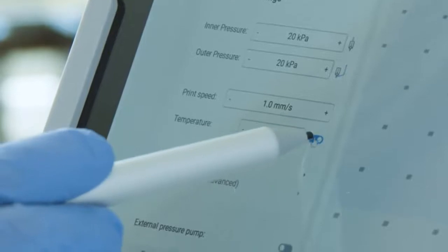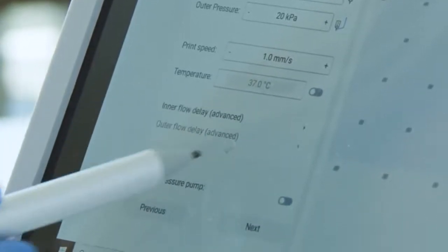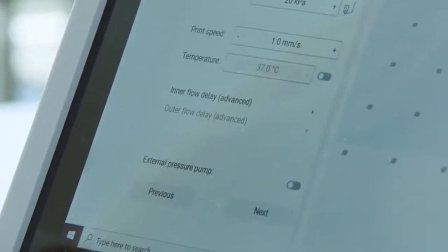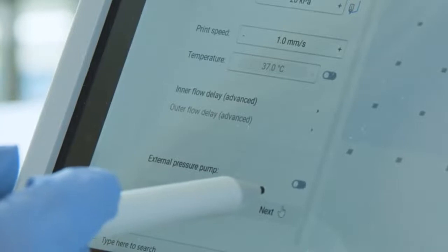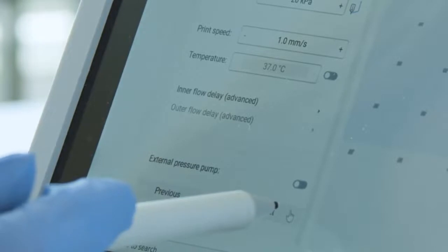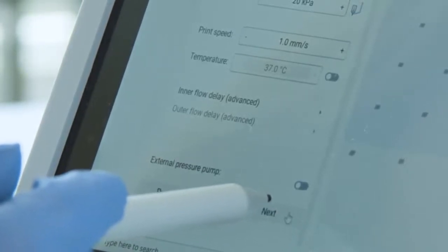And if you would like to have inner or outer flow delay, select here. We have an option here for external pressure pump. The Bio-X6 already covers the pressure up to 200 kilopascals for each printhead. And if you need to use higher pressure for extrusion, you can assemble an external pressure pump up to 700 kilopascals.